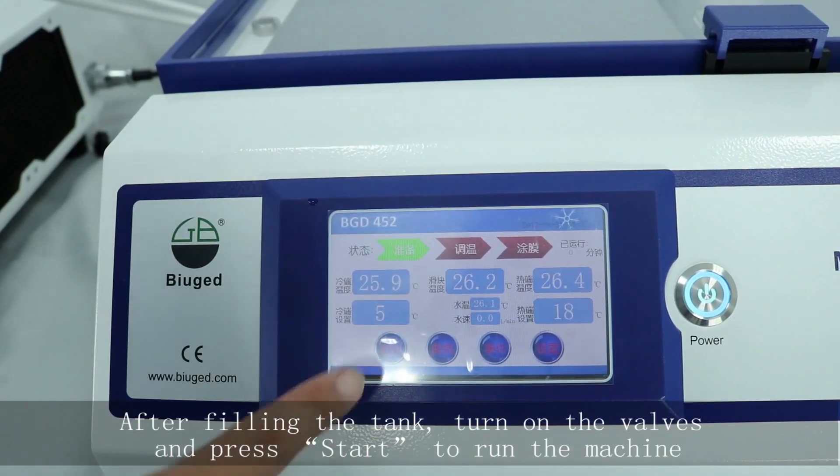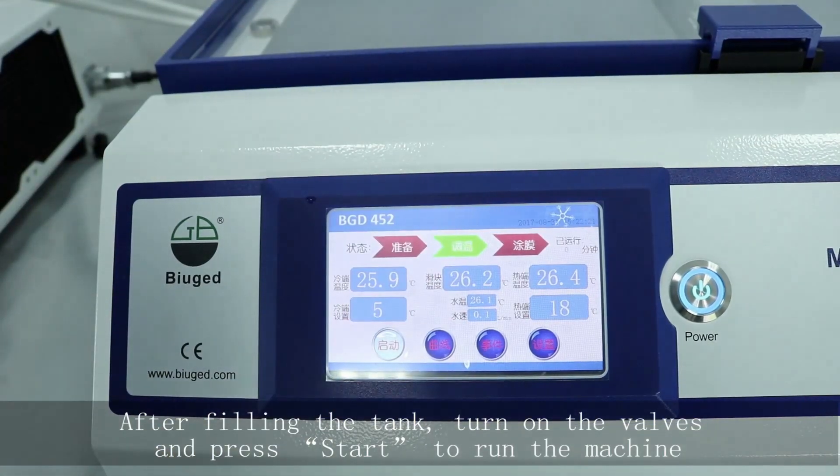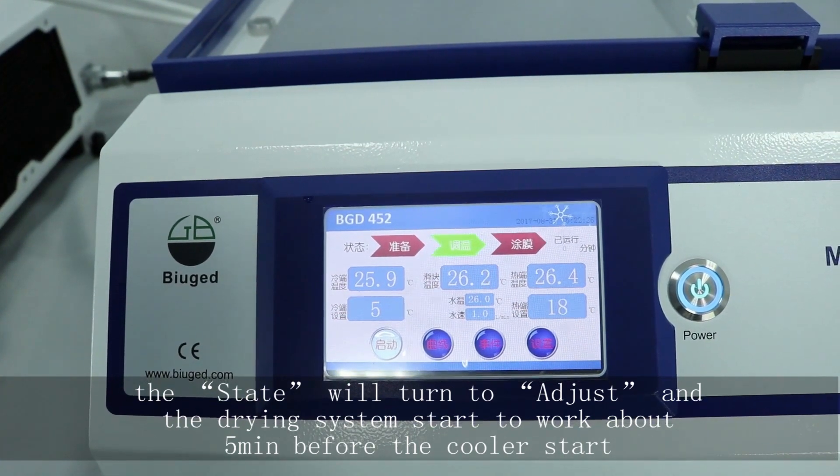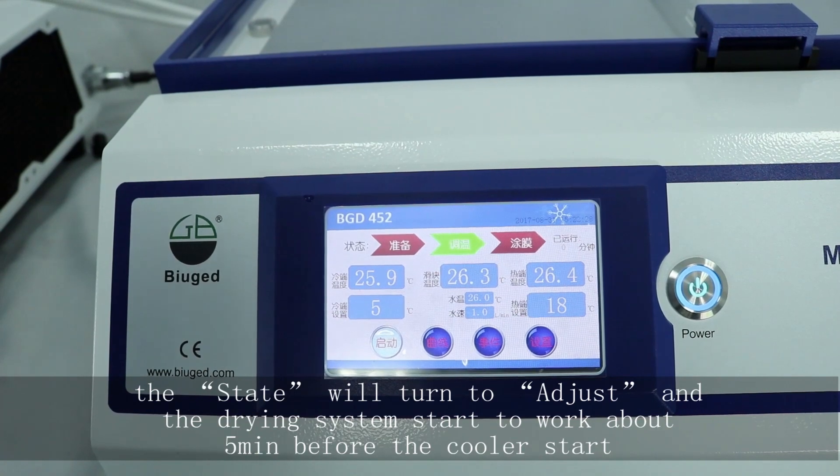After filling the tank, turn on the valves and press start to run the machine. The state will turn to adjust and the drying system will start to work about 5 minutes before the cooler starts.